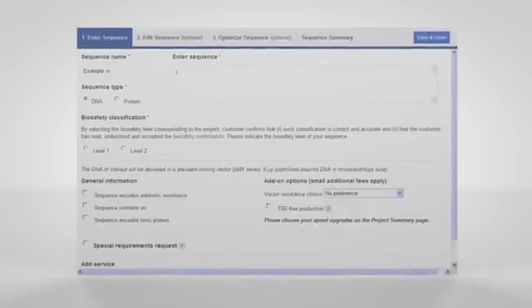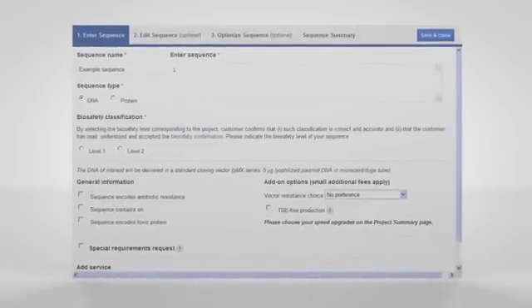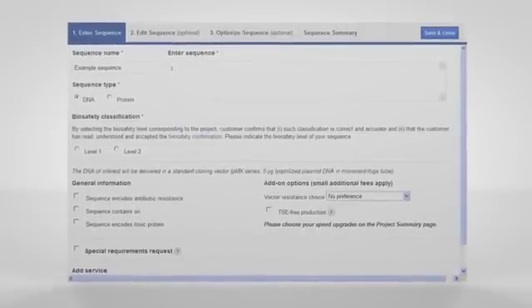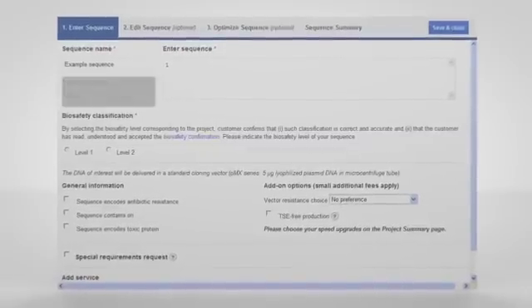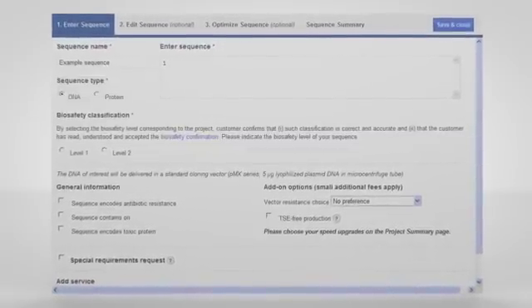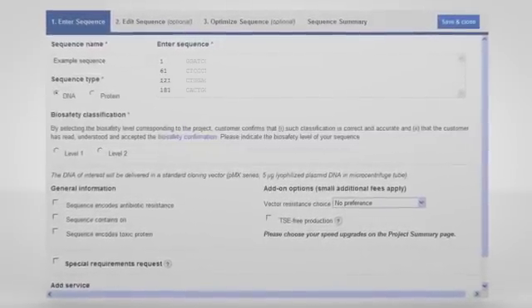Enter your sequence name, choose whether to enter your sequence as DNA or protein, and paste your sequence into the tool.